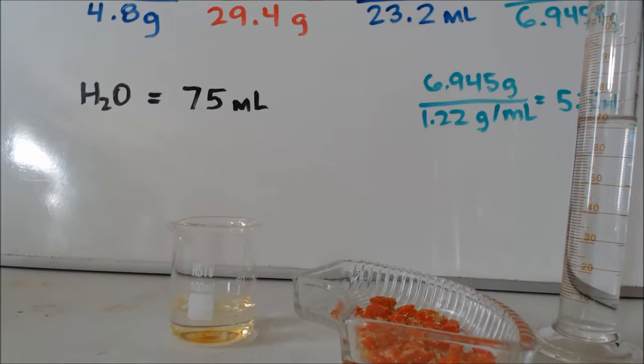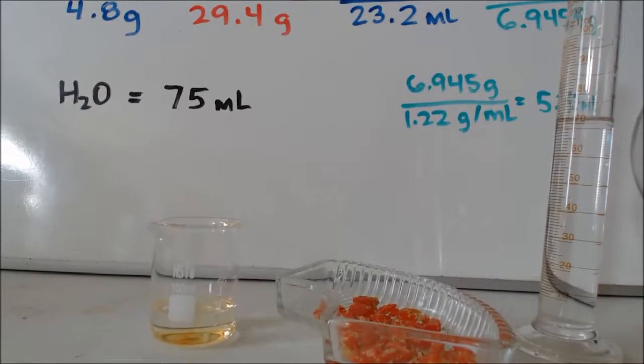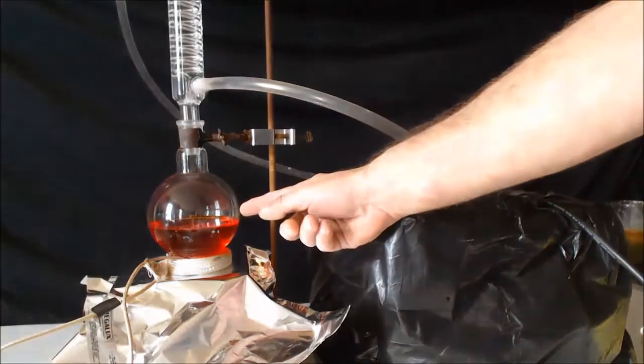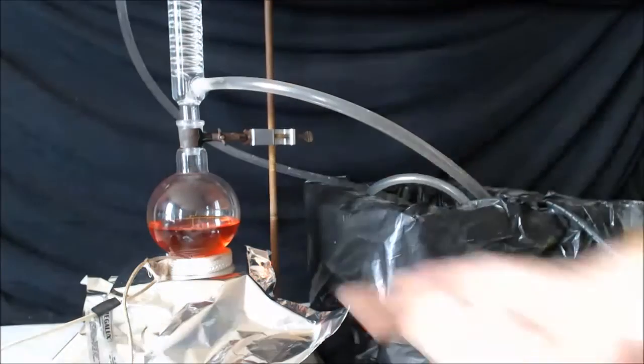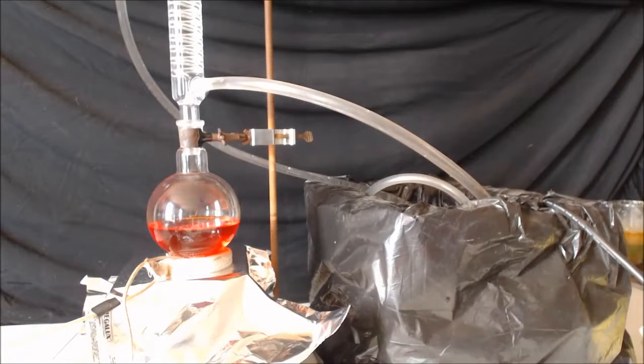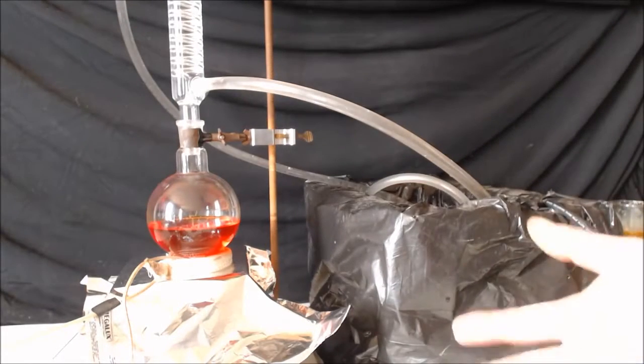I'll mix these together and make my chromic acid. Now here's my setup. I got my chromic acid in here, most of it. I had to add another 100 milliliters of water because I couldn't get it to dissolve. It's almost dissolved, good enough. I want to add heat. As you can see I got a condenser, a good kind with a coil in it.